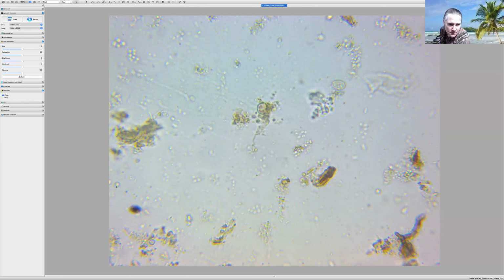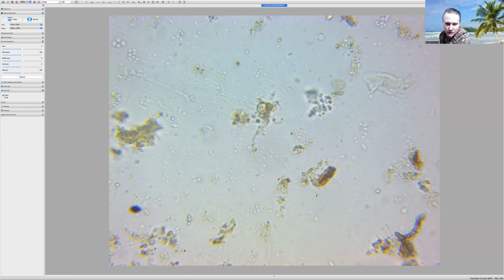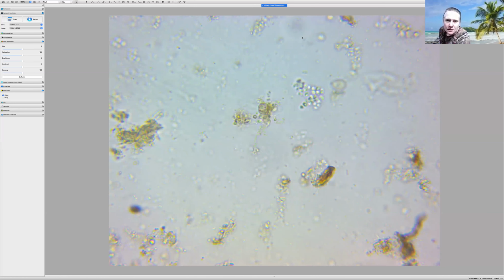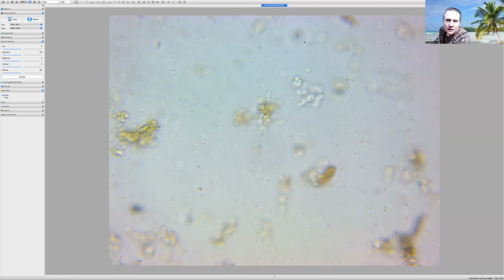That looks like a flagellate cyst. So this is a flagellate here, you can see. Here we got somebody moving slow. Yeah, we cannot let, here he is. He's all the way at the top of this screen. So we did catch him. He looked like he is a flagellate, but he's up at the top.